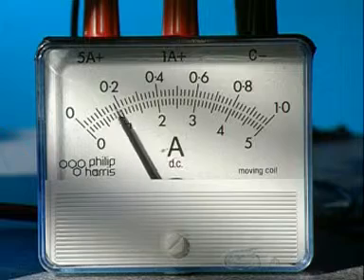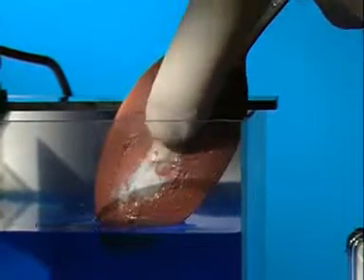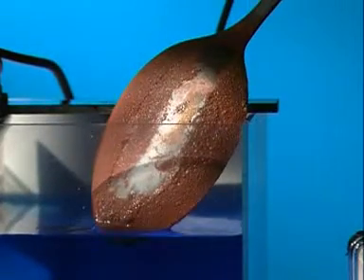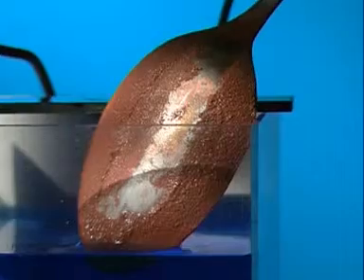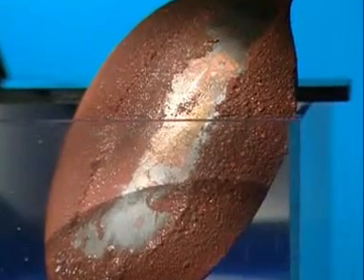Increase the current and see what happens. A thicker layer of copper forms, but the plating is poor. It rubs off easily. The size of the current used during electroplating is crucial.